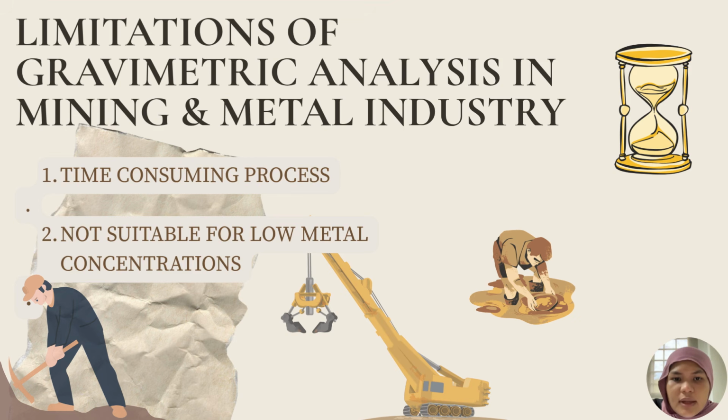Mining laboratories may need longer analysis time because precipitation, filtration, drying, and weighing must be completed carefully. Second, it is not suitable for low metal concentrations. Ores containing very small amounts of valuable metal may be difficult to analyze accurately using the gravimetric method.